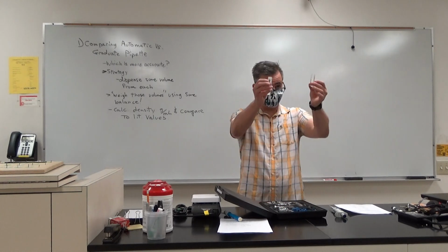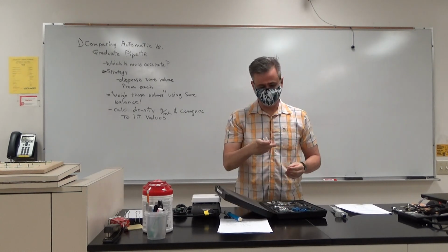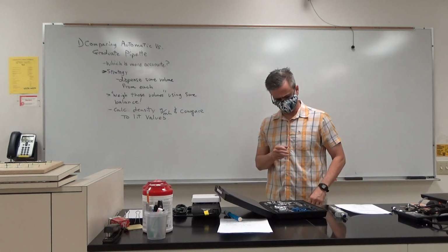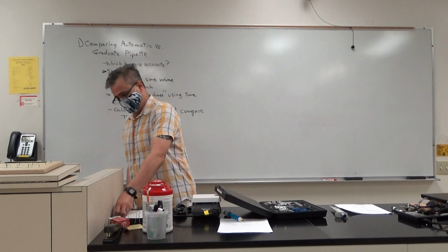These are the conical vials. They have threads on the top, so you can put on the top. There's a 3 ml and a 5 ml. What they recommend in the book is that you just use one of them, I think the 3.